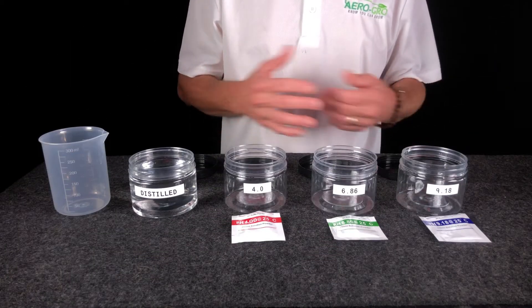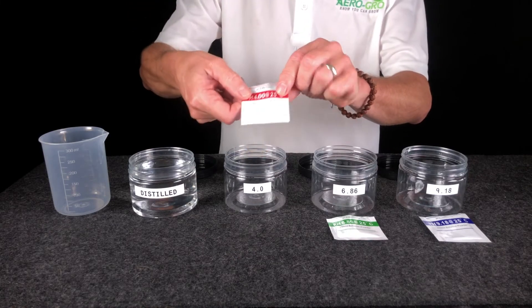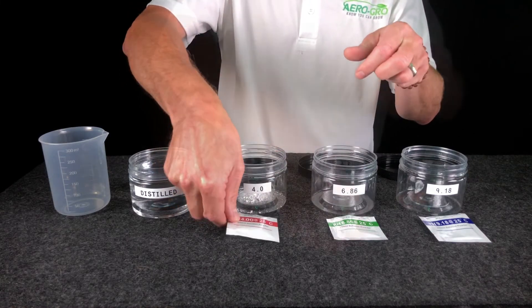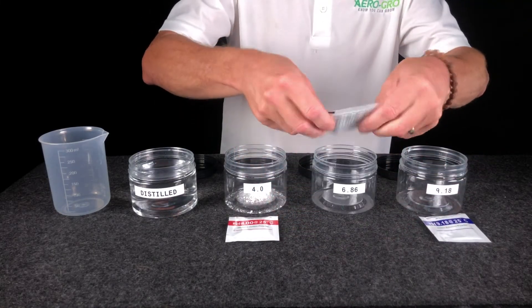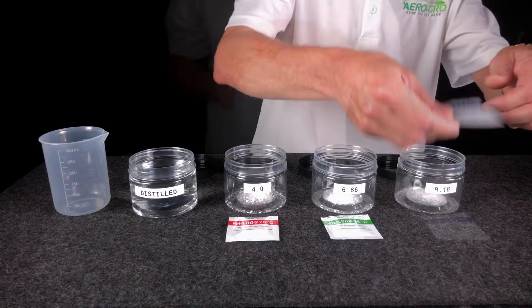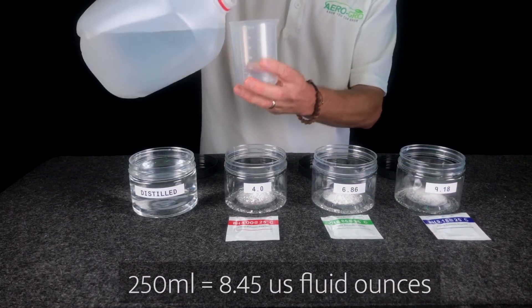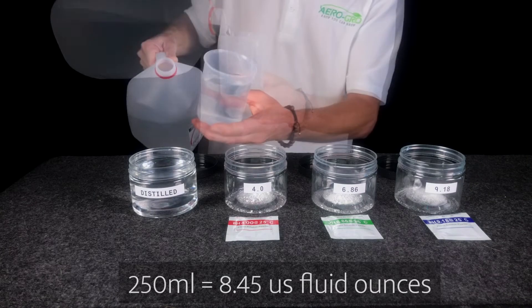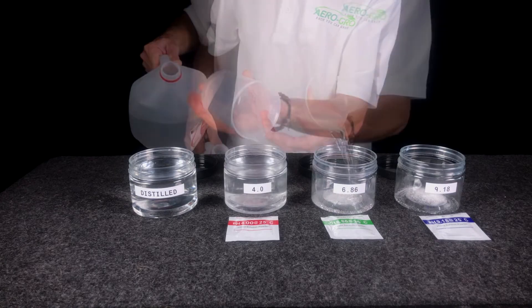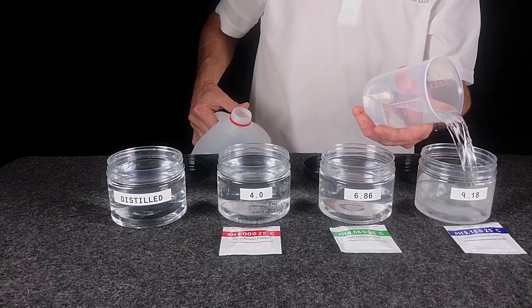Begin by emptying the contents of each buffer powder into the corresponding container — 4, 6, and 9. Then add exactly 250 milliliters of water to each of the containers — 4, 6, and 9.